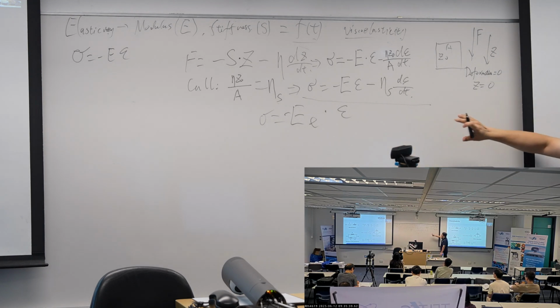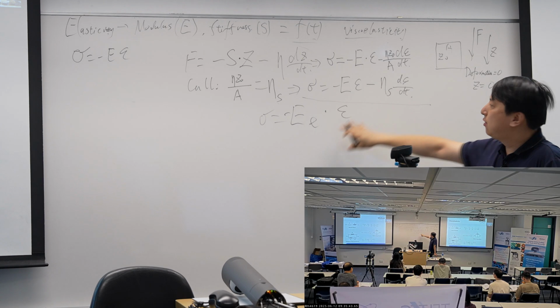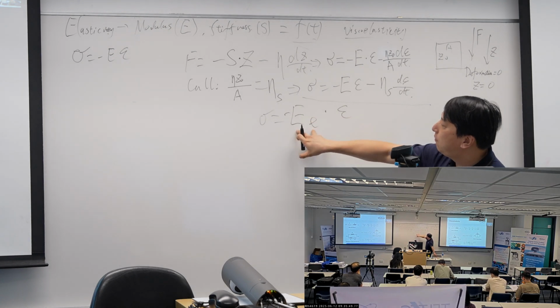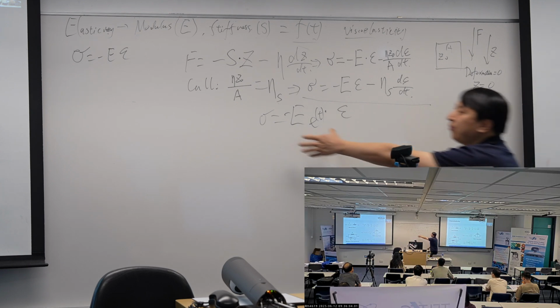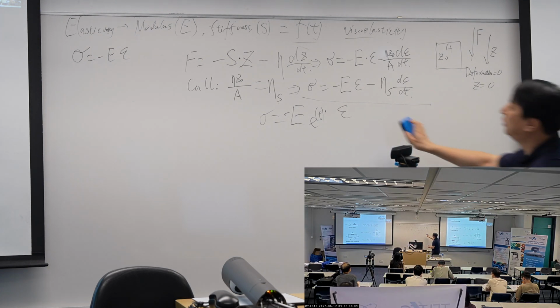And then we will use a certain effective modulus to describe these materials, and this effective modulus should be a function of time. That's the task those great scientists were facing. They tried to make up something like this. Okay, so let's see how they did it.